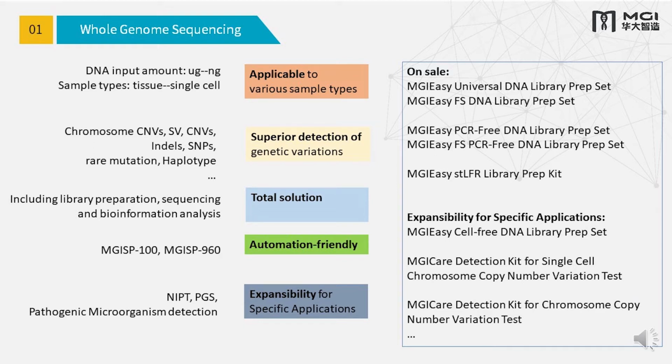And for the expansion into very specific applications: everyone knows that NIPT was the first application which helped to expand the use of next generation sequencing. Before 2008, nobody knew next generation sequencing because there was no famous or well-known application in the clinical setting. But I think NIPT opened a window and produced an opportunity for users to get to know sequencing technology.